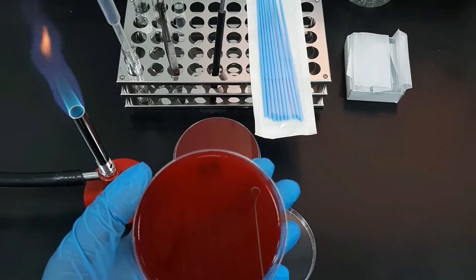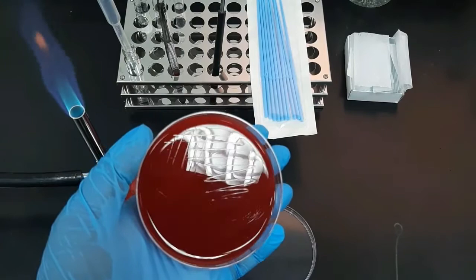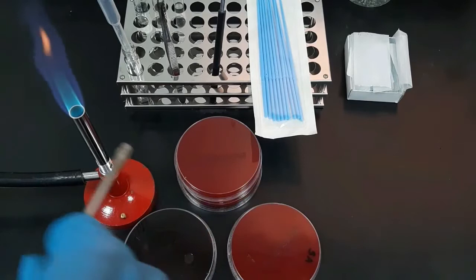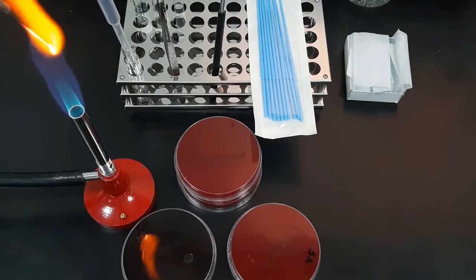Our goal in this method is to get single colonies in the final streaks. Intermittent flaming of the loop can be done during the streaking to reduce the load of the organisms so that there is a better chance of getting isolated colonies in the final streaks.